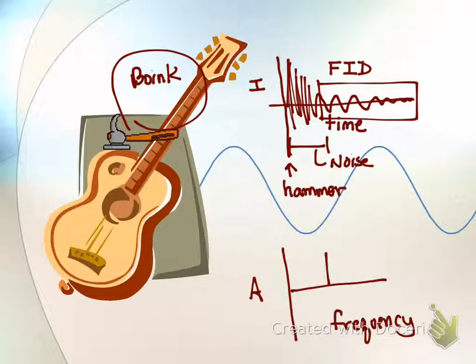Okay. Now, if you guys know anything about sine waves, they have a phase and an amplitude. This is actually the magnitude of the phase and the amplitude.